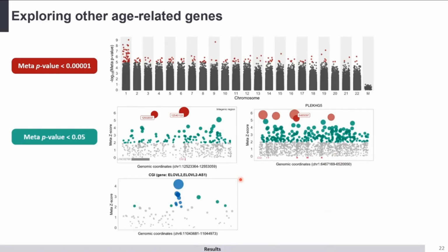As mentioned earlier, Nanopore sequencing allows for sampling a great number of CpG sites by sequencing entire genes. CpG islands, typically found near the transcription start sites, are often associated with the regulatory function of genes and promoter regions. So we expanded our scope to include, but not be limited to, established age markers targeting CpG sites within the CpG islands and additional candidates potentially correlated with age.